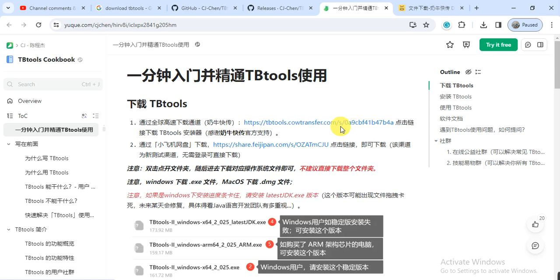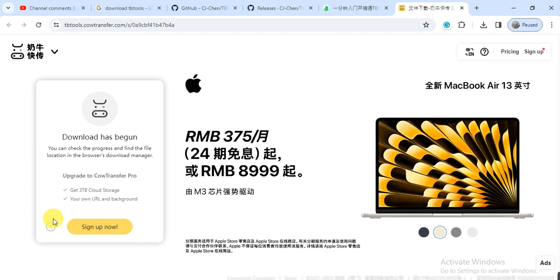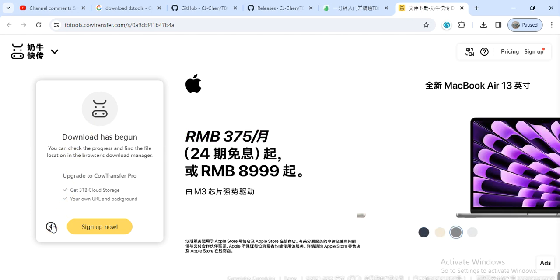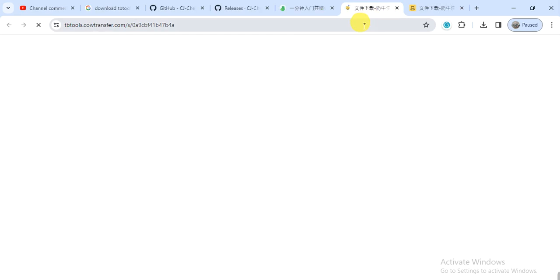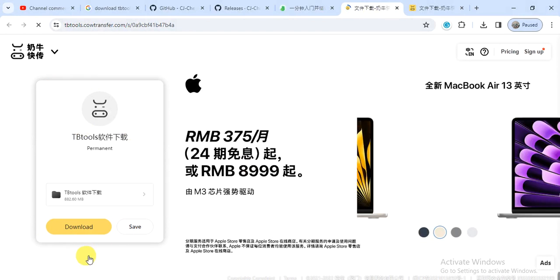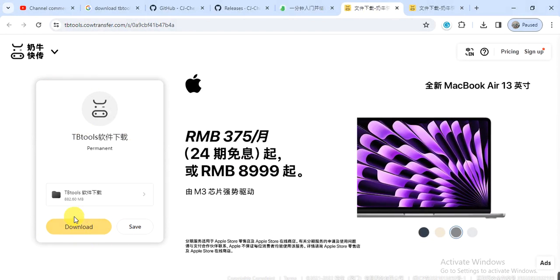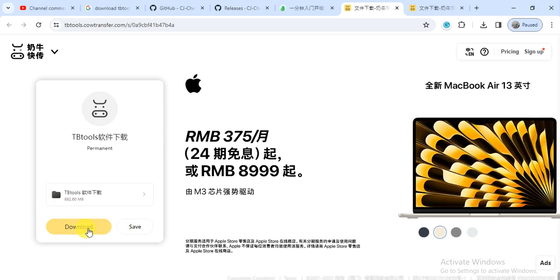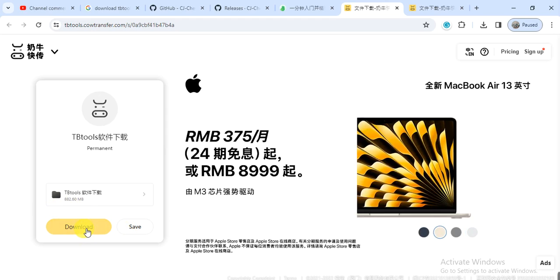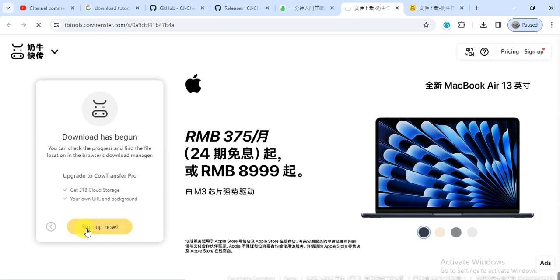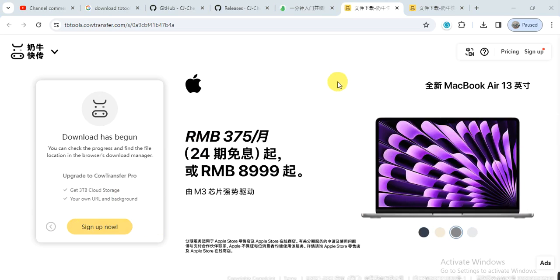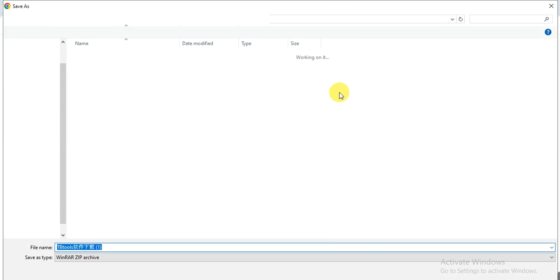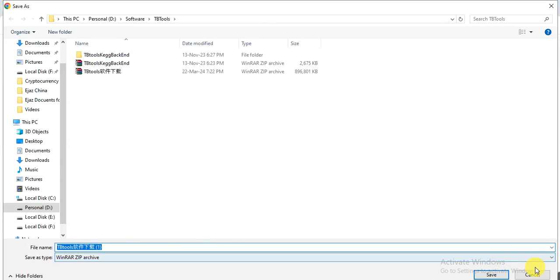Click on the link cowtransfer.com/s/0a9cbf41b47b4a. When you click on it, it will guide you to this web link. Here you will see a download button. Click on the download, and it will ask you about the directory where you want to save this. You can save it into your destination folder.